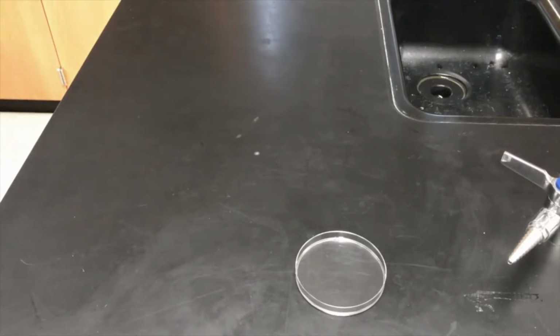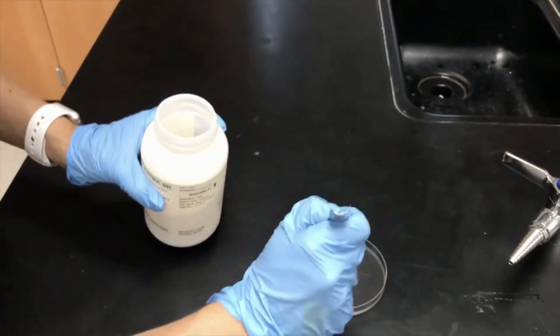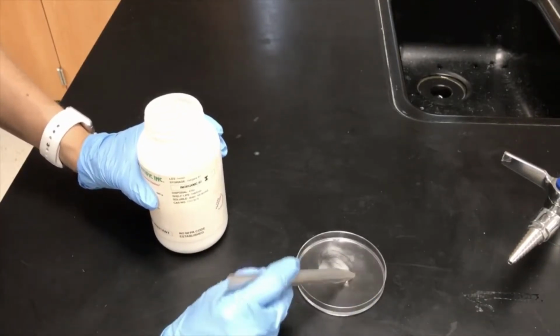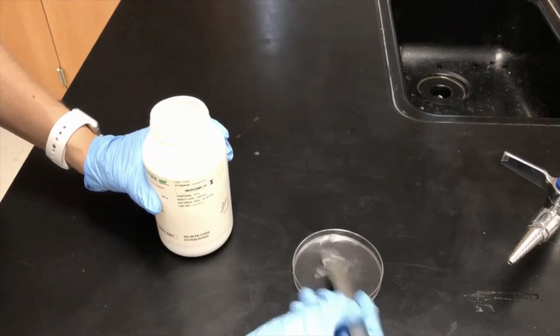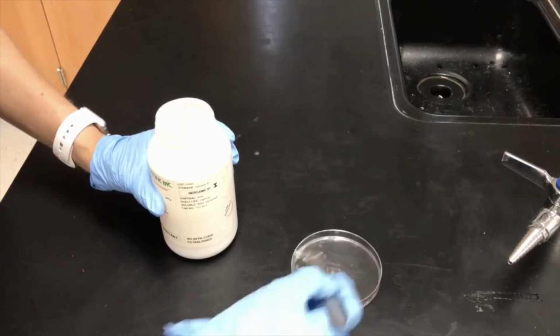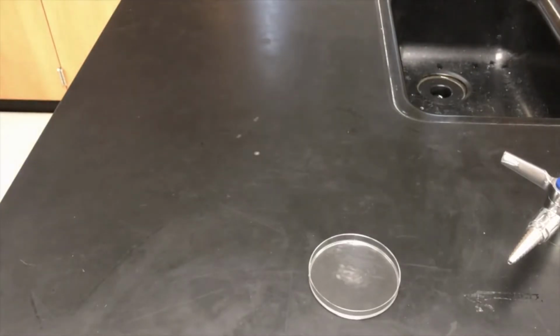Keep in mind, as I had already reviewed, your potential reactants are going to be water, sodium ions, and sulfate ions. Okay, and as we will note, it's interesting. Most of the time you can assume those will be your three reactants and that all of them have the potential to react, either to be oxidized or reduced. But for some reason, which is beyond the scope of this class, sulfate does not. So really, your two potential reactants are going to be water and sodium ions. But let's make sure that is a correct assumption.